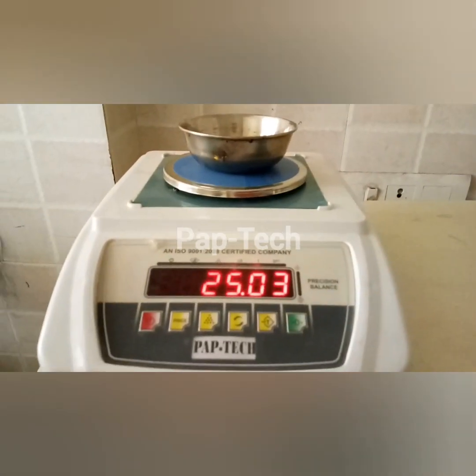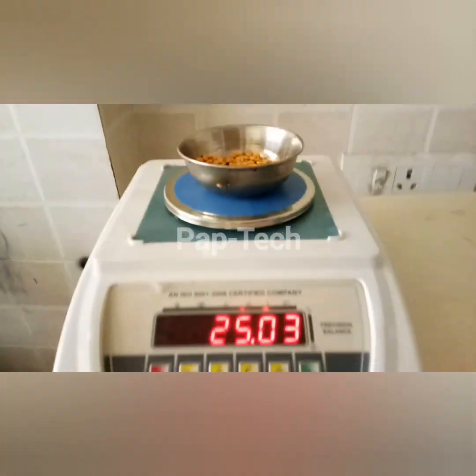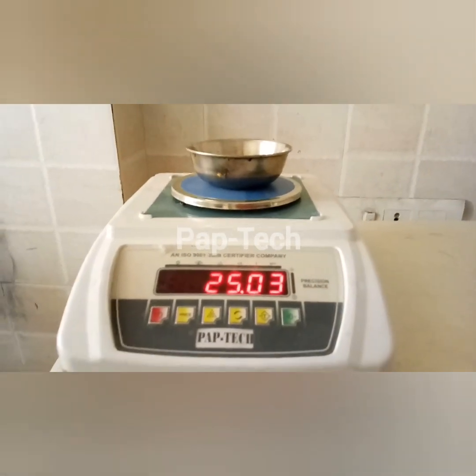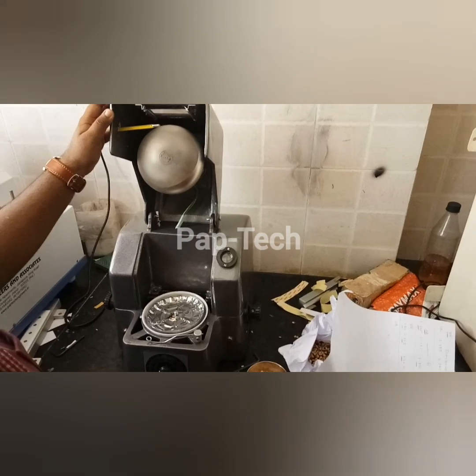This is the sample we have taken for the pulses, that is 25 grams. Now we'll insert this 25 gram sample of pulses into the infrared moisture balance to check its moisture.